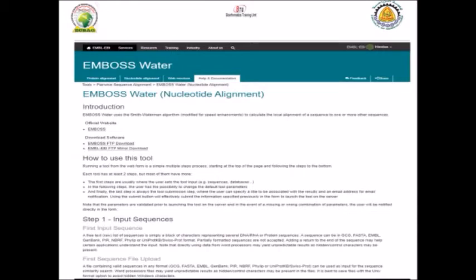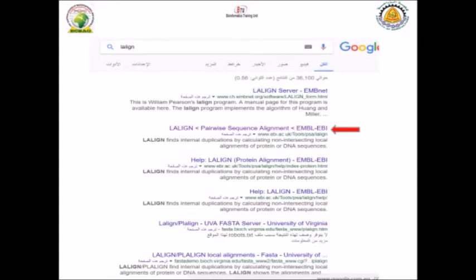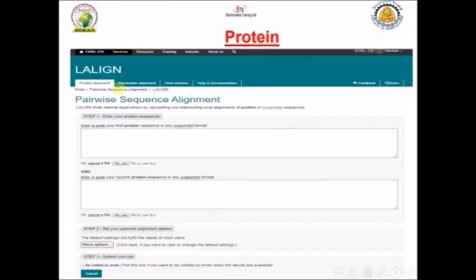The other tool is called LALIGN, and it also exists on the same website. This tool can find internal duplications between two sequences. It's available on the same EMBL-EBI website and API, and it can be used for protein or nucleotide sequences. You can easily find it by writing in Google 'LALIGN pairwise alignment EMBL-EBI tool' and it will come up immediately.